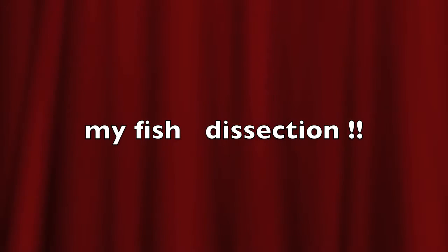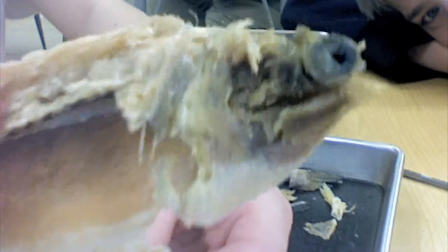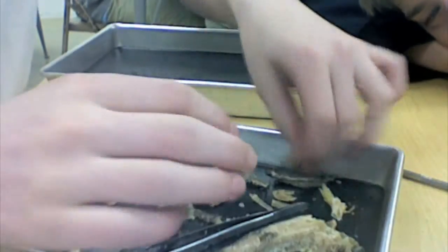Hi everyone, my name is Nate. I'm going to do a fish dissection of a female pike, and I will show you all of the organs, fins, and whatever Mr. Bean, my teacher, told us to keep. So, YouTube, hi. My first video.